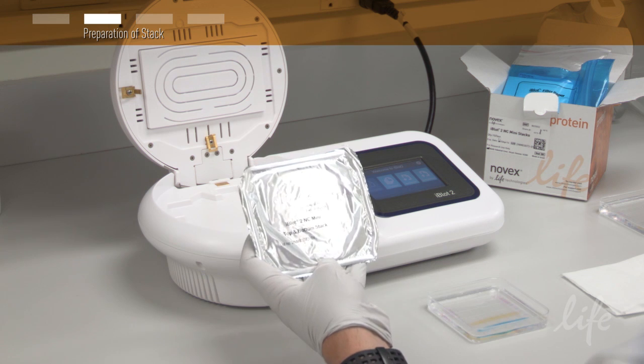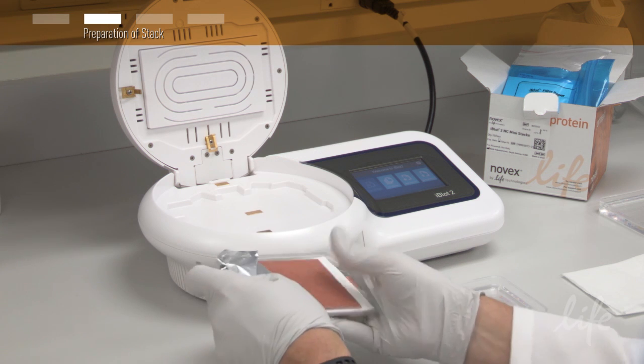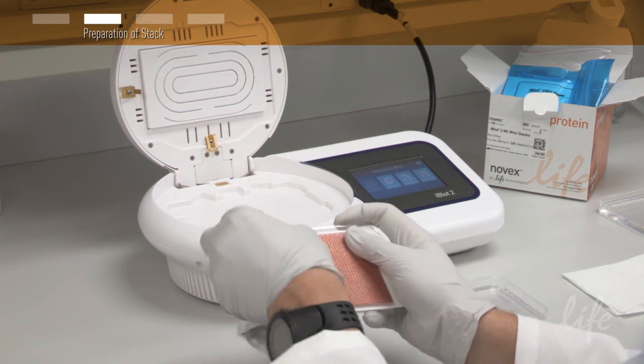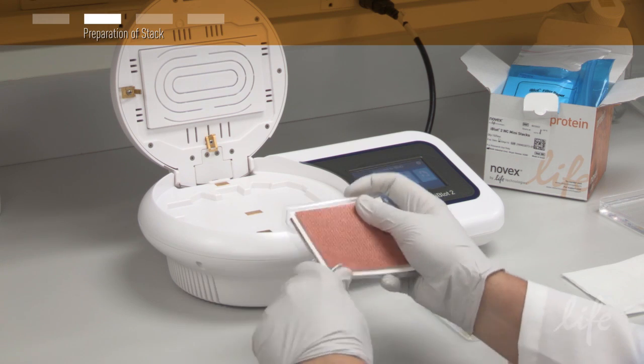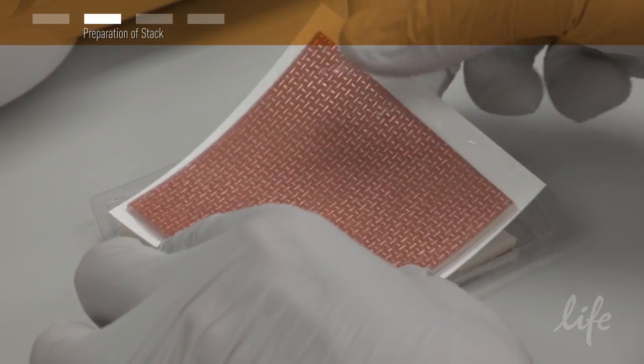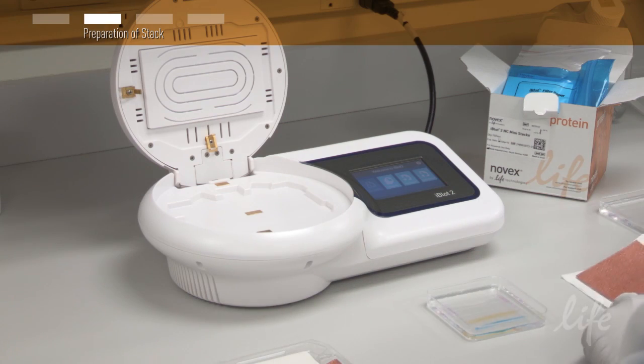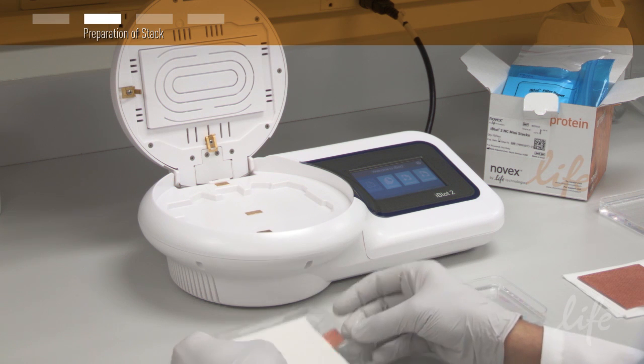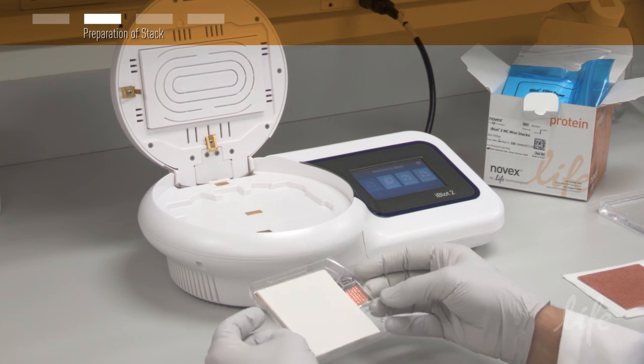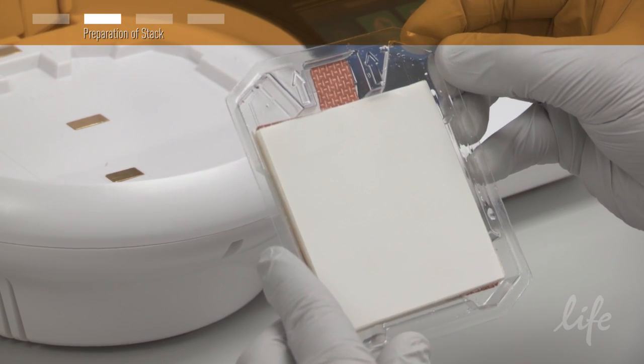Next, unseal the transfer stack. Notice that the top and bottom stacks are in the same tray. Separate the top stack and set it aside. Keep the bottom stack in the plastic tray. You'll notice that the bottom stack contains your PVDF or nitrocellulose membrane.